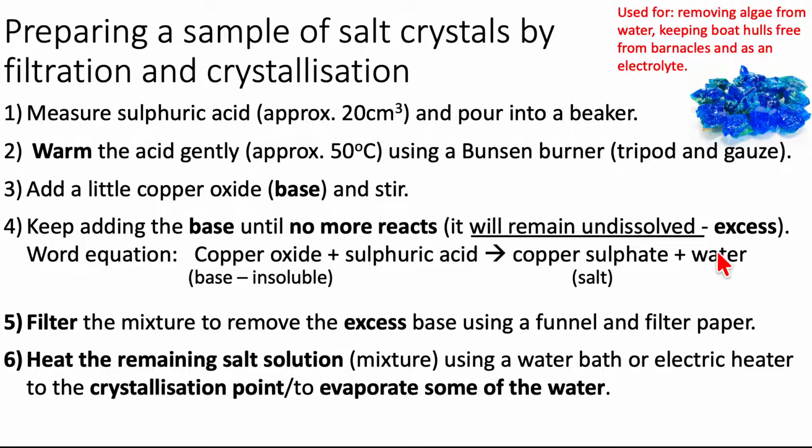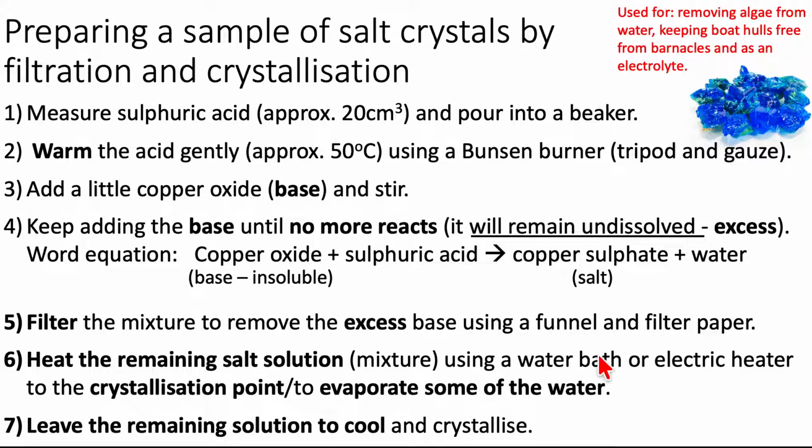So we're getting rid of this bit because that's what we want. Finally, we're going to leave the remaining solution to cool down and crystallize. We could also add at the end that a little bit of drying of the crystals with the likes of filter paper can be done as the final step.